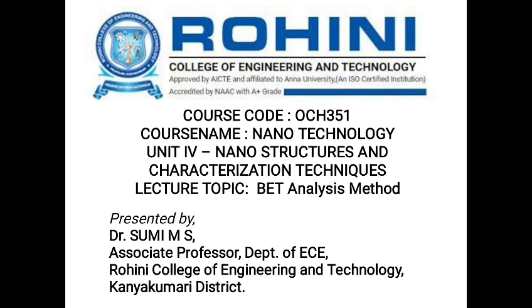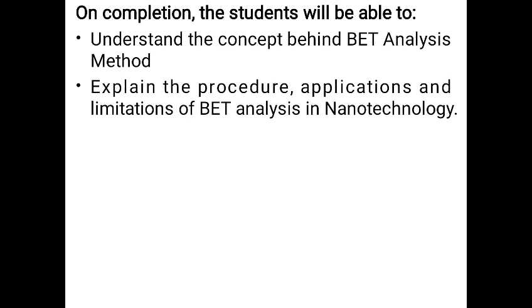Sumi MS. The topic of my today's presentation is BET analysis method from Unit 4 Nanostructures and Characterization Techniques. On completion, the students will be able to understand the concept behind BET analysis method and also explain the procedure, applications and limitations of BET analysis in nanotechnology.